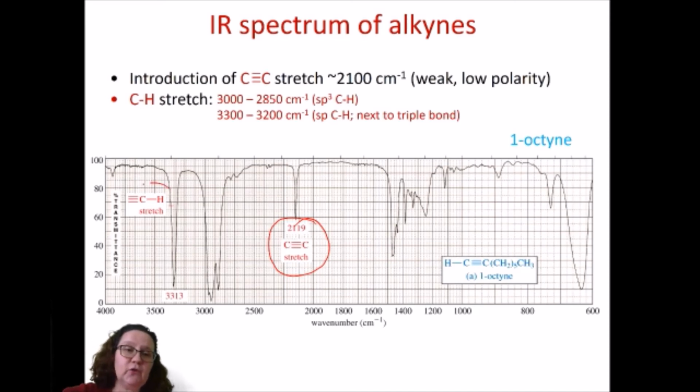You will observe also the carbon-hydrogen stretching band of the hydrogen that is attached to the sp carbon, the carbon involved in the triple bond, and as you can see, they tend to be quite strong bands. Additionally, you will also be able to see the carbon-hydrogen stretch vibrations related to the hydrogens attached to sp3 carbons, all the carbons that are not part of the triple bond, that again give you quite strong bands.